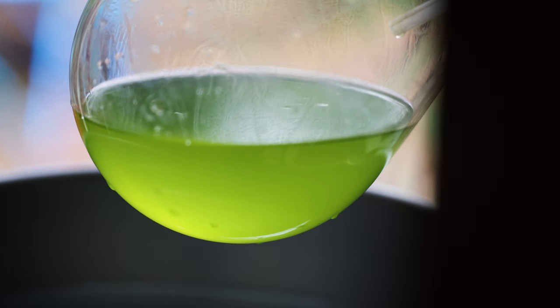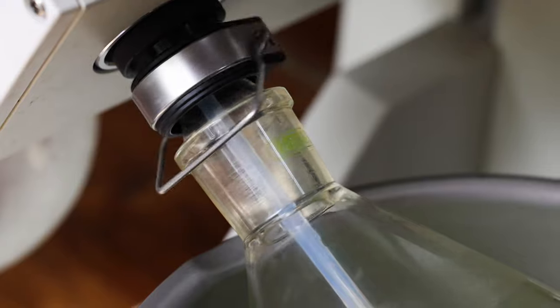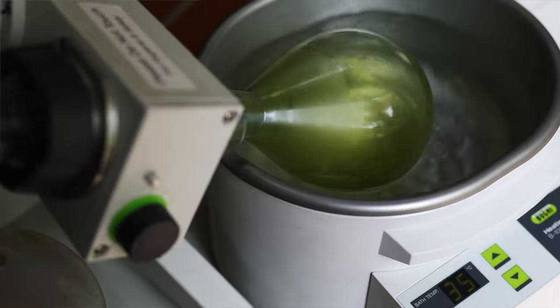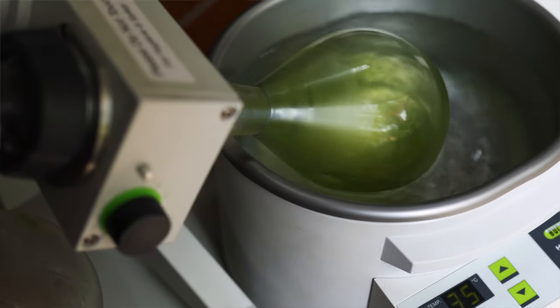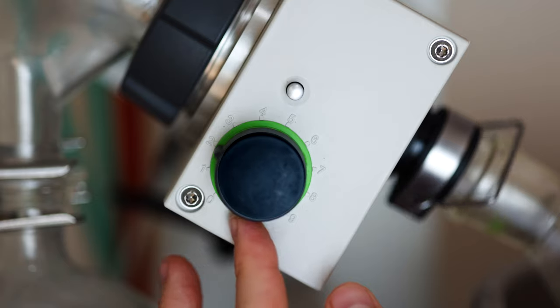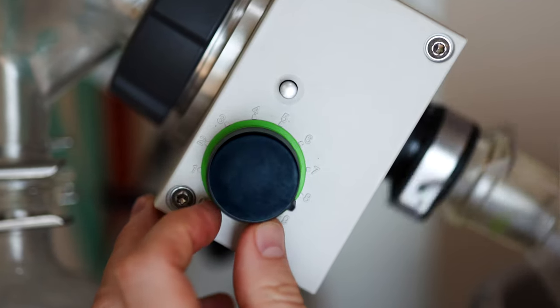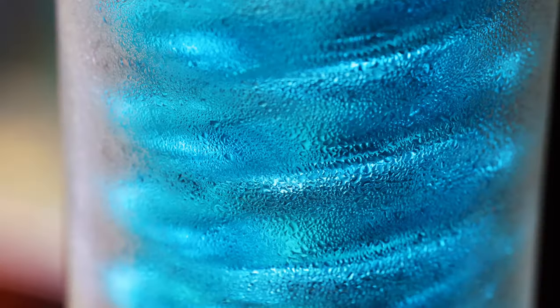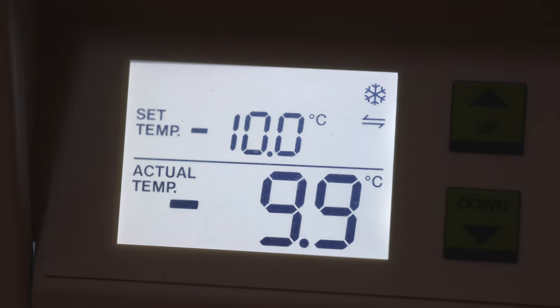My infusion goes into the flask, which hooks up to the rotavap with the pressure dropped within the system. The flask rotates to increase the surface area of the liquid and speed up distillation. I can control the distillation run by managing the rotation speed, the water bath temperature, the level of vacuum, and the temperature of the condensing coils. The evaporated infusion condenses on coils chilled to minus 10°C, and that condensed distillate drips down into the second flask where I collect my low temperature distilled lemon verbena.